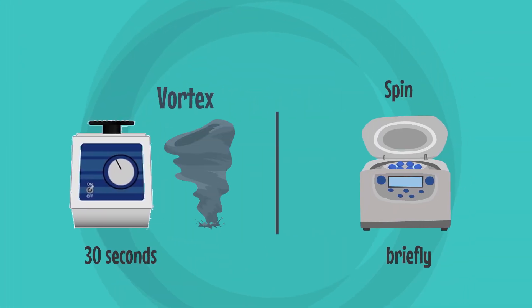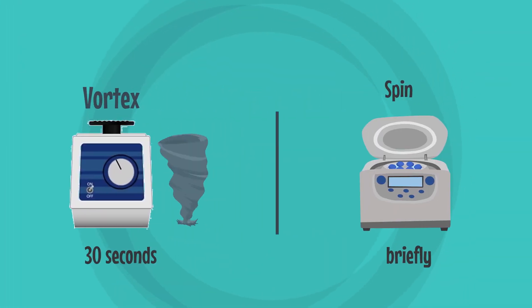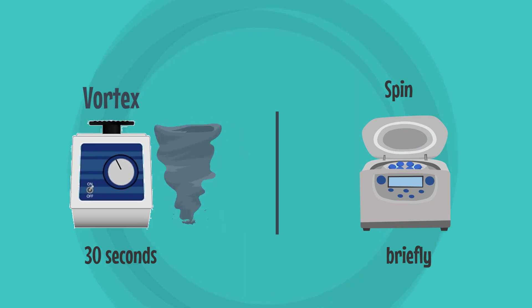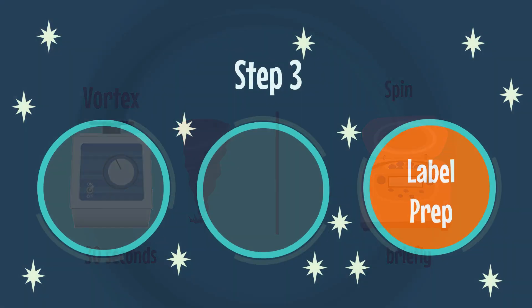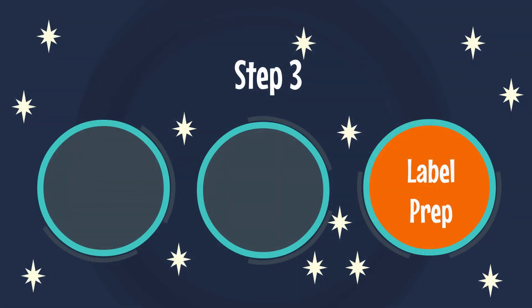Vortex for 30 seconds and spin briefly. Step 3: Label Prep.